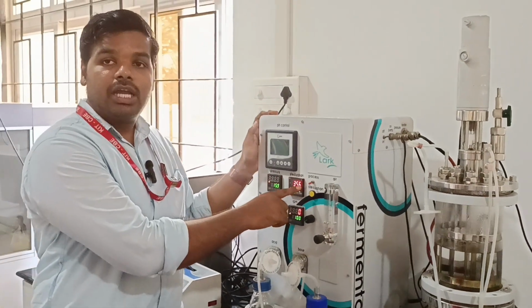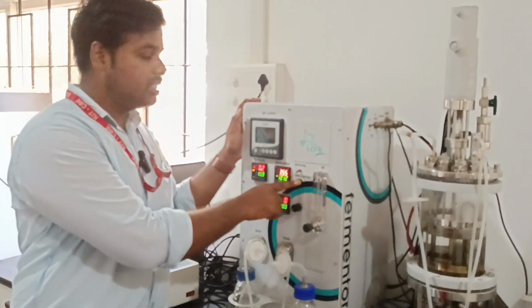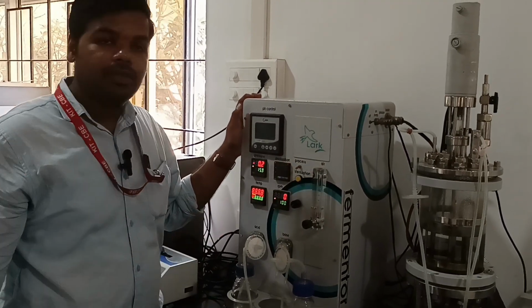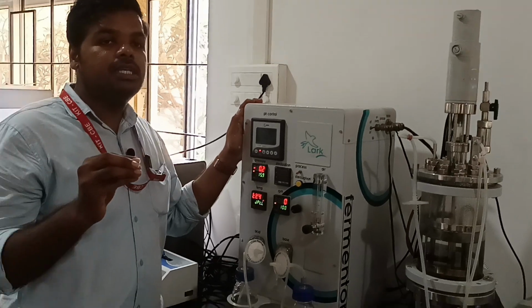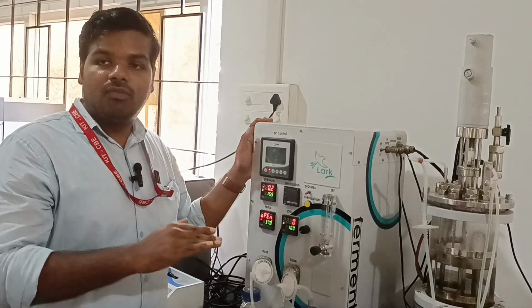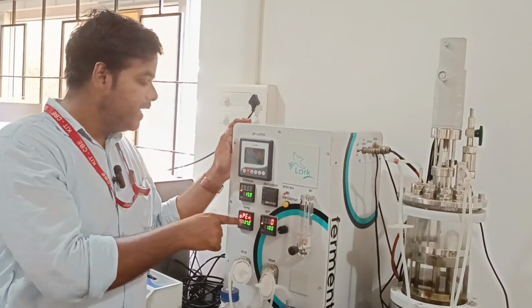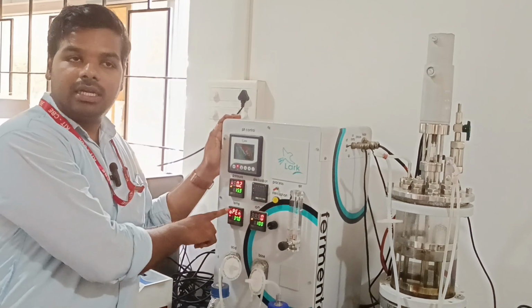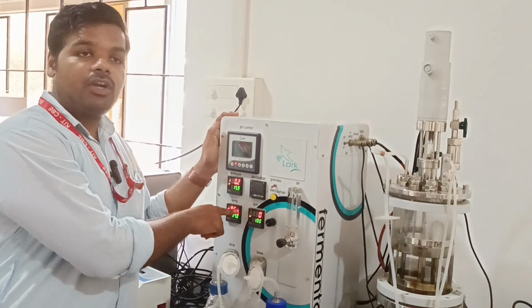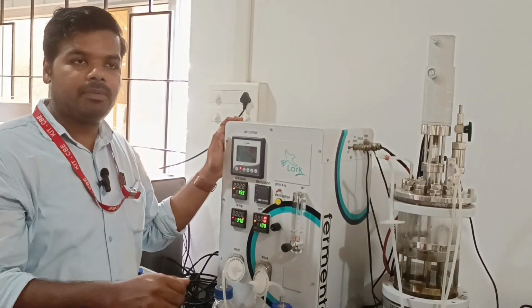What we need to do is note the temperature every 2 minutes. When you start the experiment, you can discontinue it. So every 2 minutes until it reaches 121 degrees Celsius, note down the temperature. Once that temperature is reached, we can switch off the sterilization and we can see the temperature now in the temperature panel. We have another panel here. From that 121 degrees Celsius to the normal temperature, you need to continue it. So this is our experiment.